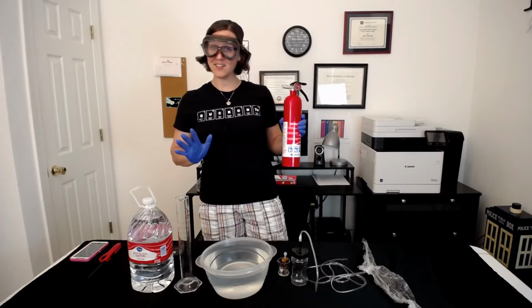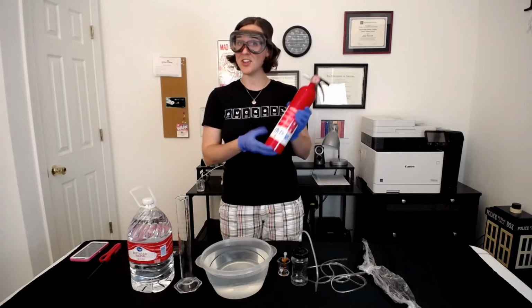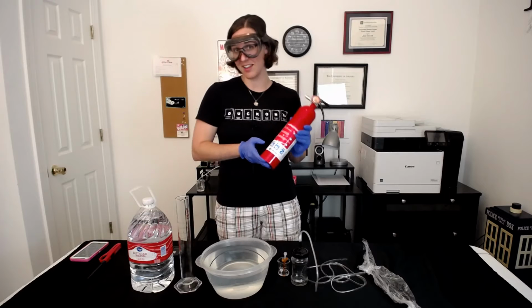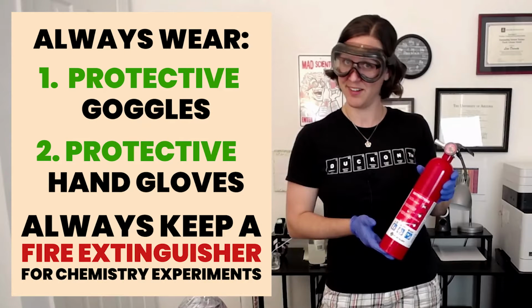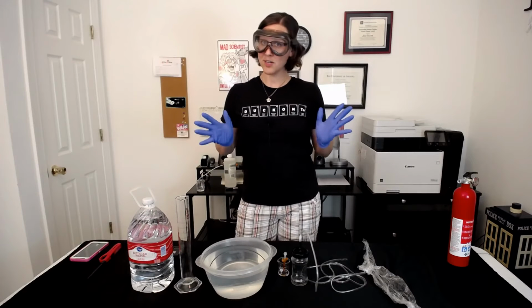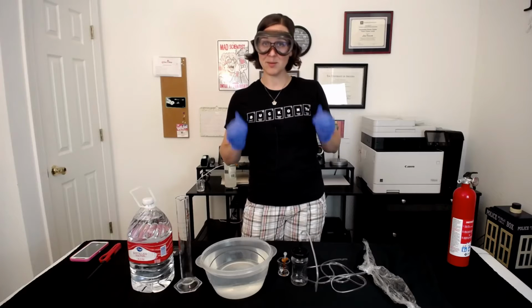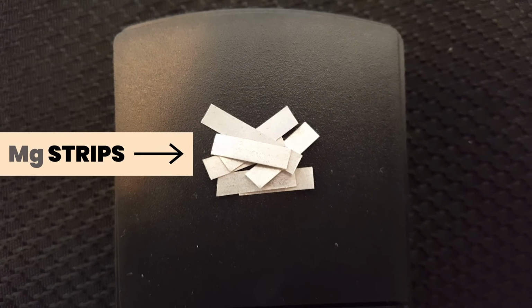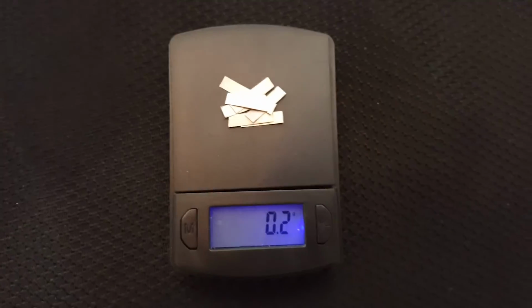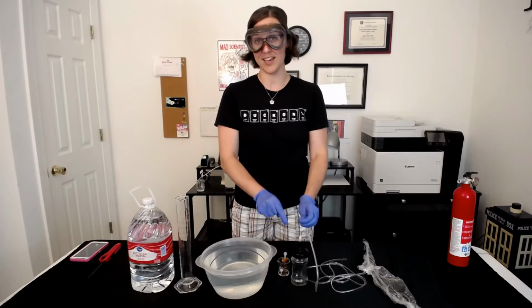For this lab, safety is of utmost importance, so make sure you're wearing your goggles, your gloves, and you have a fire extinguisher handy if you are going to light the hydrogen gas on fire at the end of the experiment. According to our calculations, I already massed out 0.2 grams of magnesium ribbon, chopped into tiny bits. We're going to take our 0.2 grams of magnesium ribbon and add it to our reaction vessel.